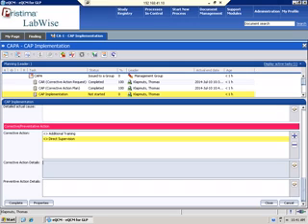I can put some details. So retraining on balance use. Again, you see the squiggly line is for any typos. This is some spell checks. And then if there's any additional details, if you have preventive action, so how do you prevent it in the future? They need more supervision. Again, this is just an example of a possible CAPA process.